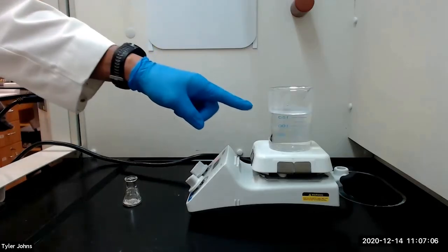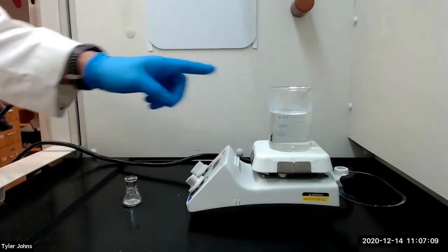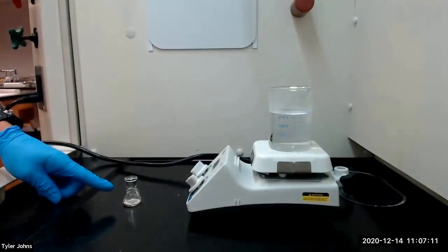We will next add three milliliters of hot 70 degrees Celsius water to the crystals in the 10 milliliter Erlenmeyer flask. We will then stir the mixture until all of the solid crystals have dissolved.